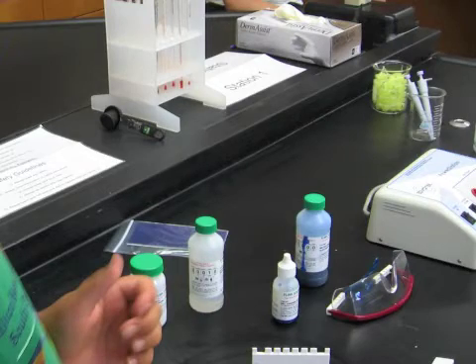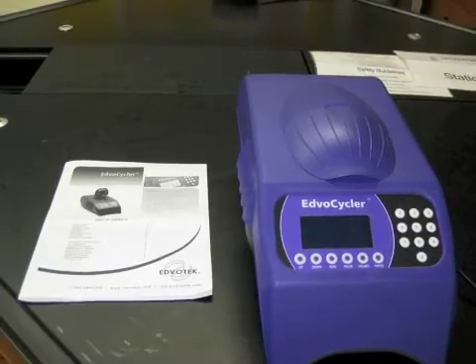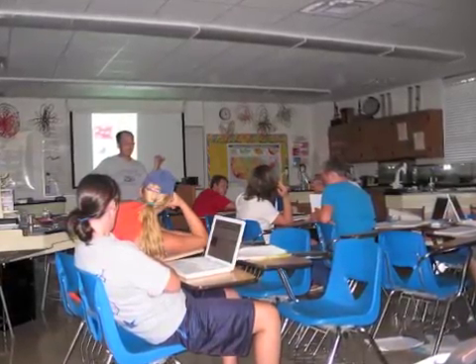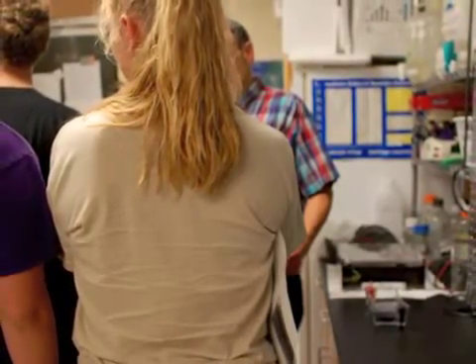When we toured Dr. Chapes' lab, they could see how they could take what they learned in class and apply it directly in the workforce. If they decided to go to college, they could work in a lab that used gel electrophoresis, which is really a commonly used bioassay. They were really excited when they walked around Dr. Chapes' lab because they could see a lot of the same equipment that we had in our lab, although they do think our thermocycler looks cooler because it's purple. They also got the opportunity to make some connections and find job opportunities, so that's always a nice thing to do.